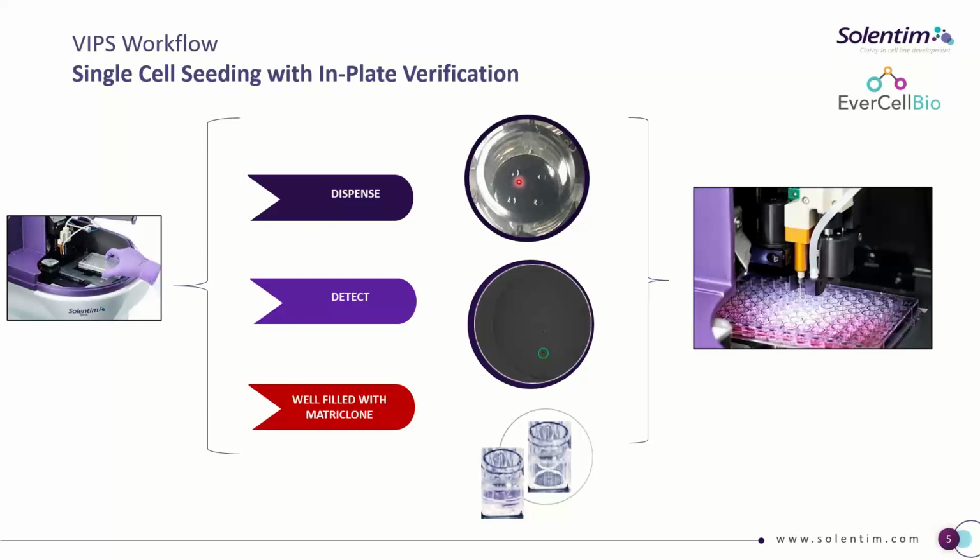If there's no cell in that first droplet, we apply a second droplet on top, and then we can continue on to a third and fourth droplet into that loci to see if we've got a cell or not. If you've got the concentrations pretty much spot on in the cell reservoir, you would typically get a cell identified in the first 3 to 5 droplets on that particular spot. The other option, if you had your cell concentration a little bit out of kilter, is you could actually go up to 4 positions with 4 spots in each loci, so 16 droplets, but it wouldn't make it a particularly efficient process if you did it that way.